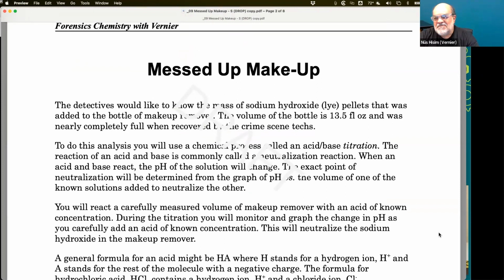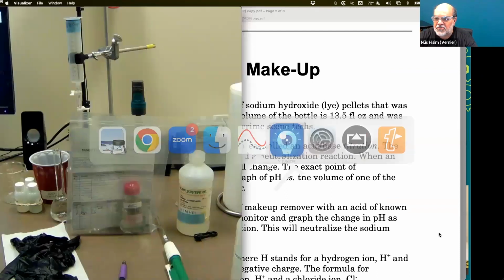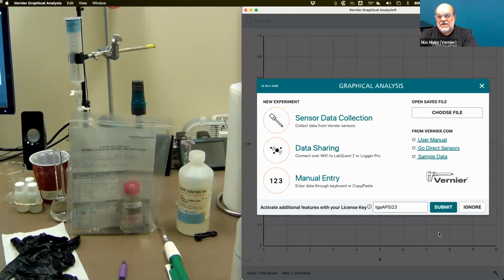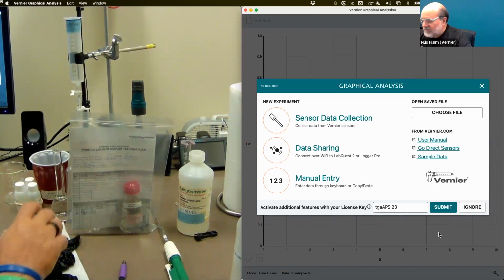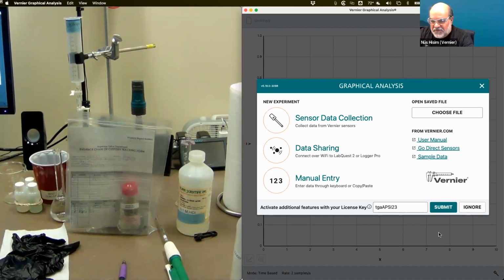It's a very common sort of thing that we would probably expect our students to be able to do, at least in calculations, and maybe even in a lab experiment. So I thought it would be kind of fun to take that and make it something that was very entertaining. I don't know about entertaining, but certainly exciting for students. So I've got my evidence here, and we're going to treat it just like you might do in your classroom. I used chain of custody forms and all that.